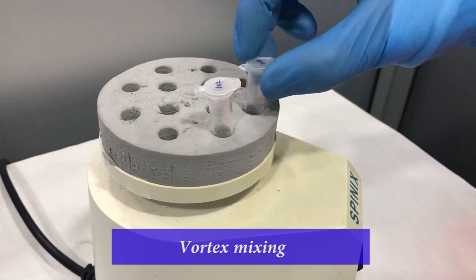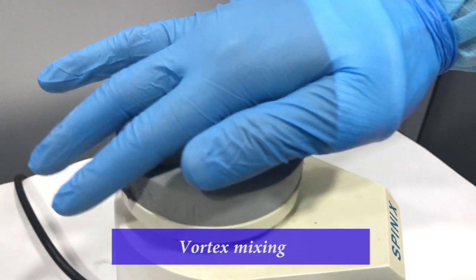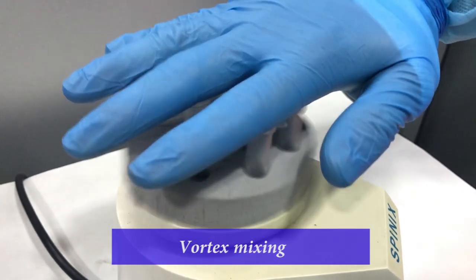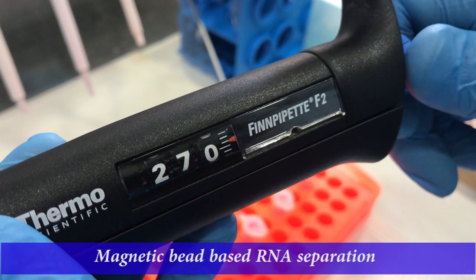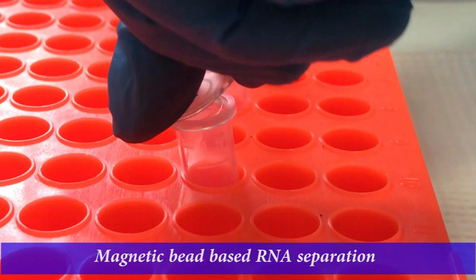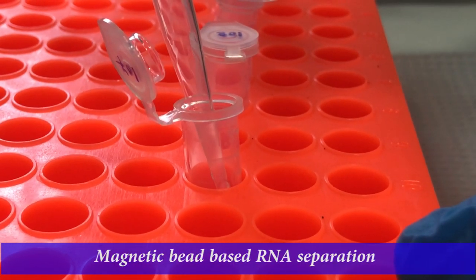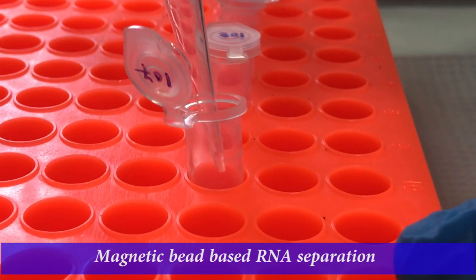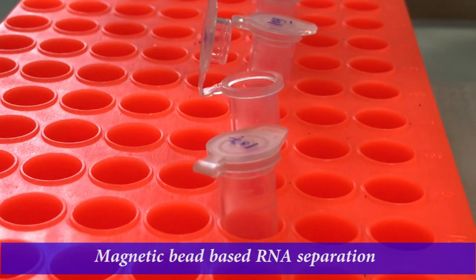Vortex the tubes containing lysis buffer with samples for 30 seconds. Arrange the tubes in order in the rack and then add 270 microliter of isopropanol into each tube carefully and mix each time. Each time, take a new tip for adding isopropanol to the next tube.